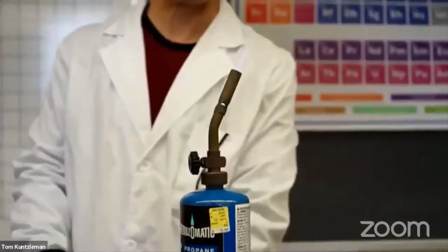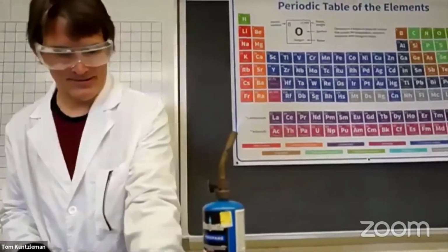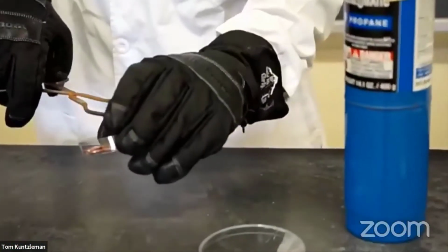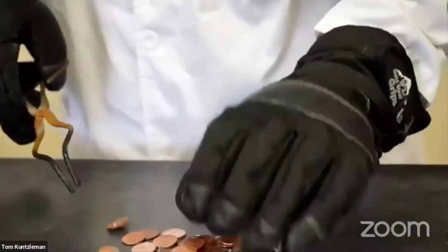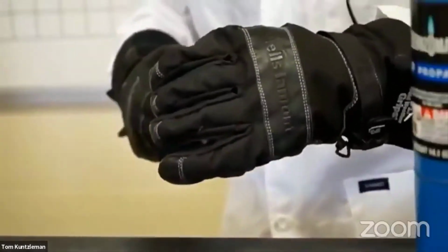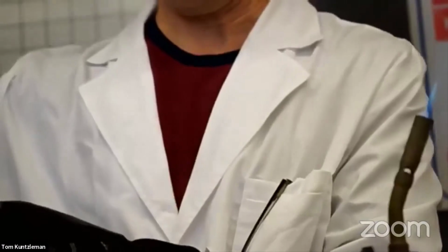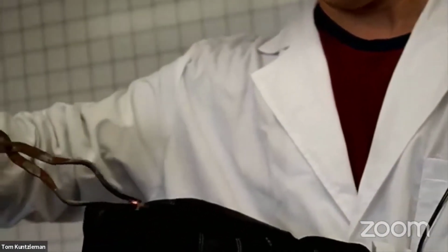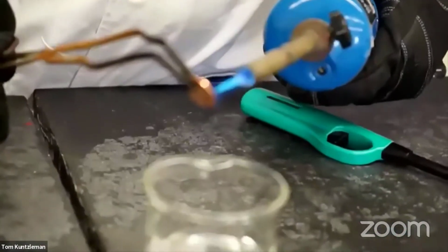Let's try the new one first. Give me a little second here. It's a little tough to grab these with these gloves. Like that. There we go. Okay. So this is a new penny. What's that date on there? 2017. So this penny was made in 2017. I'm going to go ahead and heat that penny.